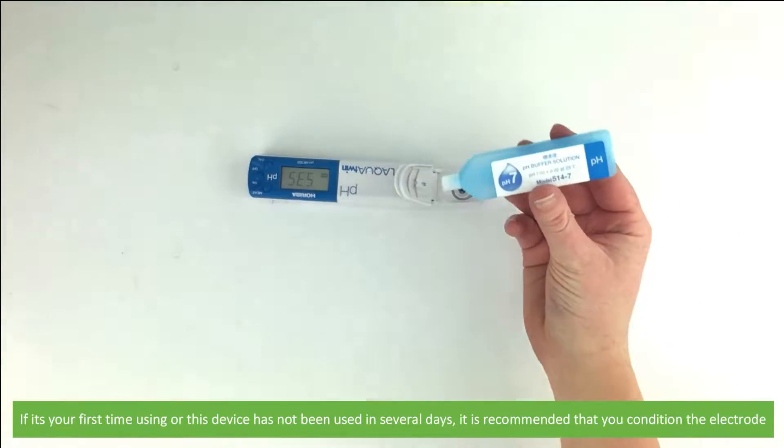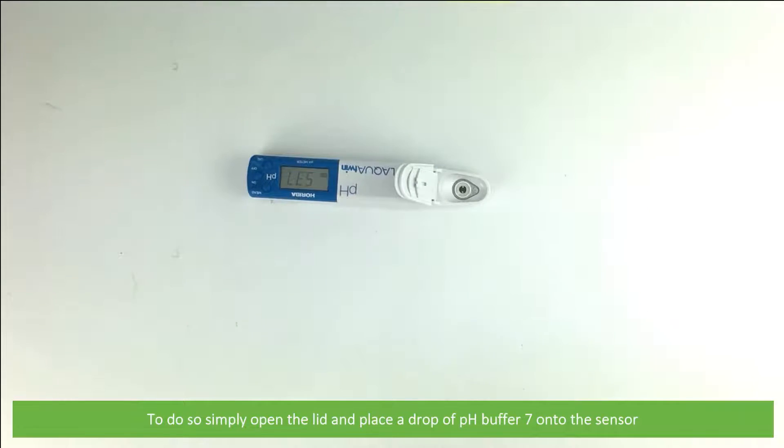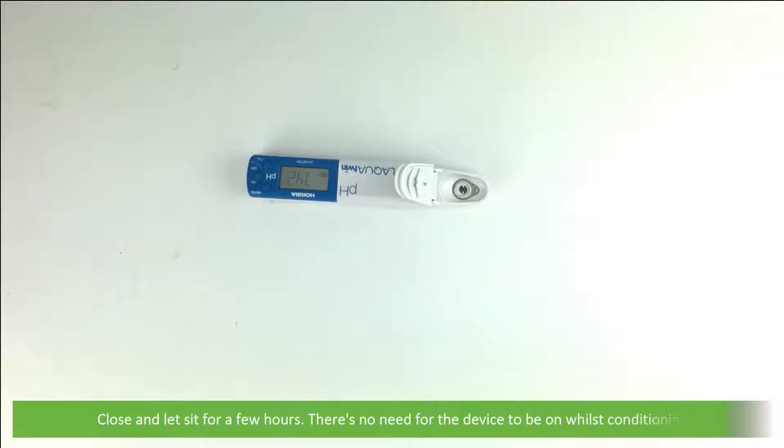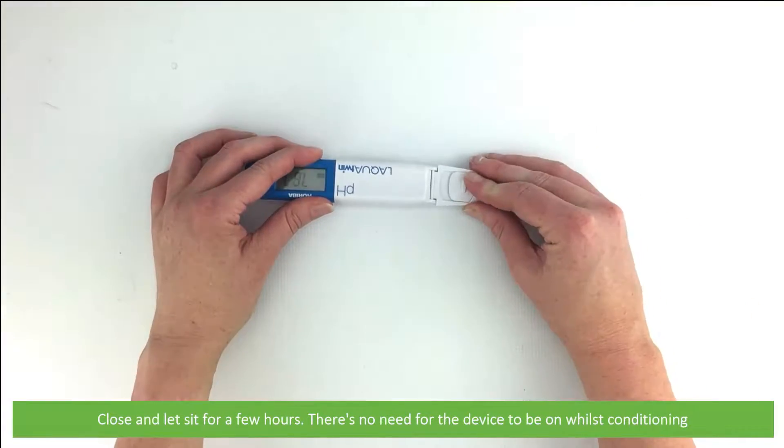To do so, open the lid and place a drop of pH buffer 7 onto the sensor. Close the lid and let it sit for a few hours. There's no need for the device to be left on whilst conditioning.